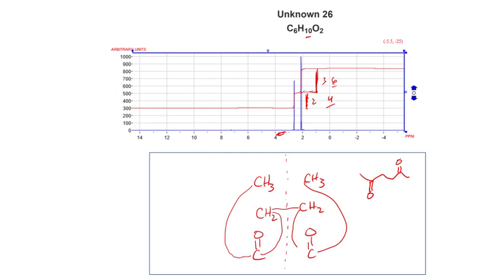There you go. Chemical shift, look good? Well, we have this CH3 here and here. These two are at delta 2.0, which is perfectly fine for CH3 next to a carbonyl group. And then these 2 CH2s, now the key here is that because they are at identical chemical shifts, they do not split each other. You cannot see any splitting for hydrogens that are at the same chemical shift. So that's about 2.6, and that's a singlet. Singlet 2.0, singlet 2.6, and we're done. Hope you enjoyed that.